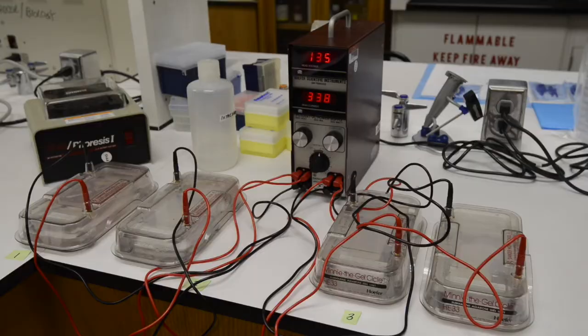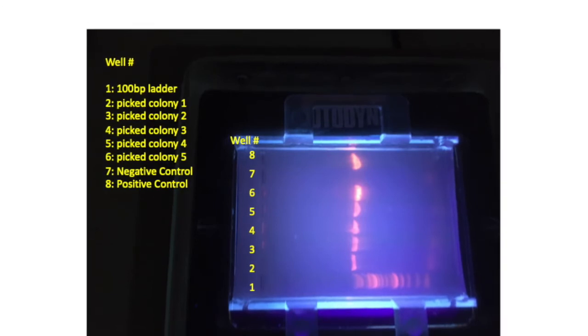Once the electrophoresis is completed, you can move your gel on its carrier tray to a UV transilluminator, and you'll see results that look like this. Lane 1 contains the DNA ladder. You can see from the DNA ladder the smallest fragment size is the bottom of the gel on the far right-hand side in this image. That's 100 base pairs long.